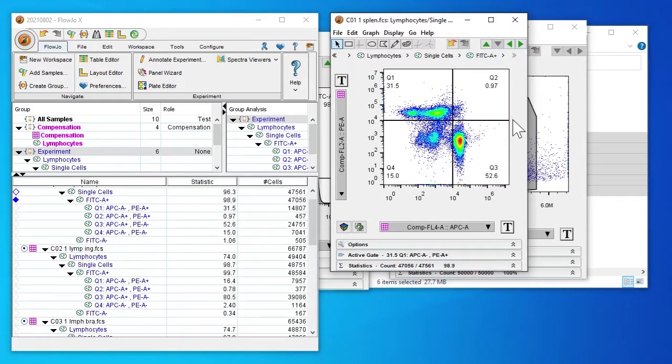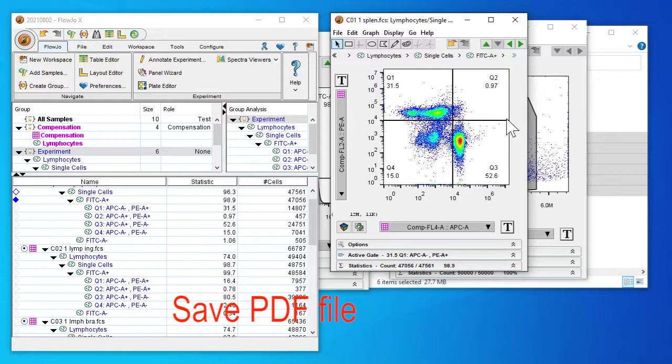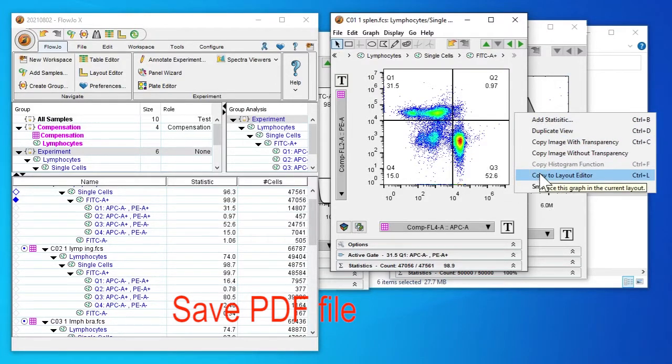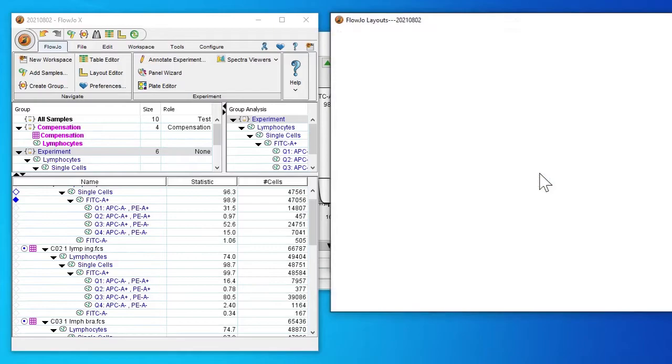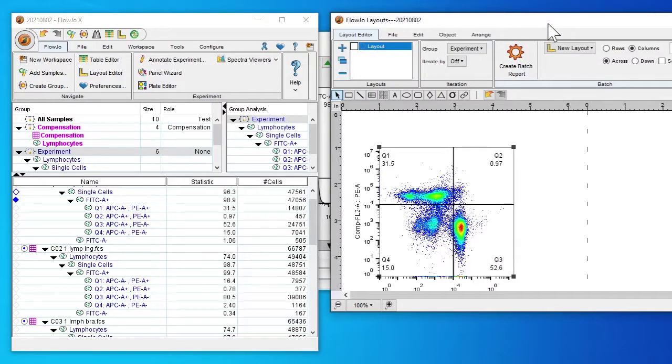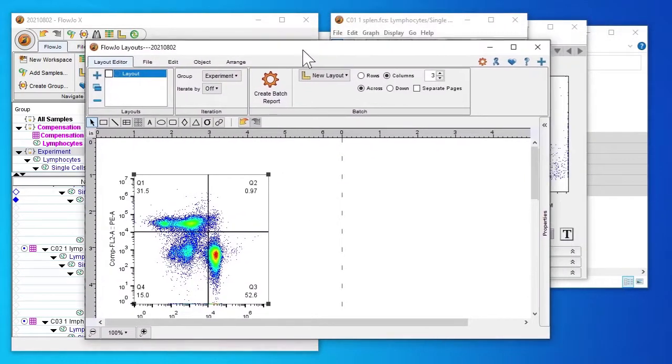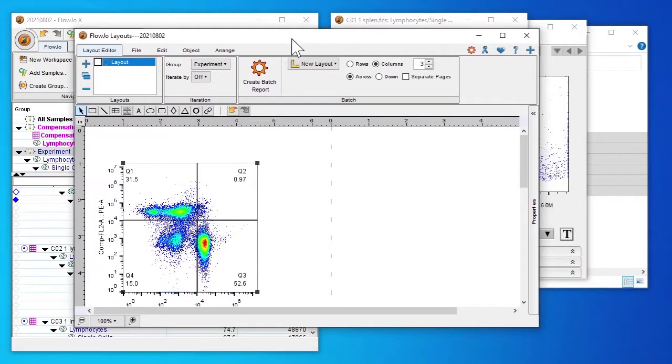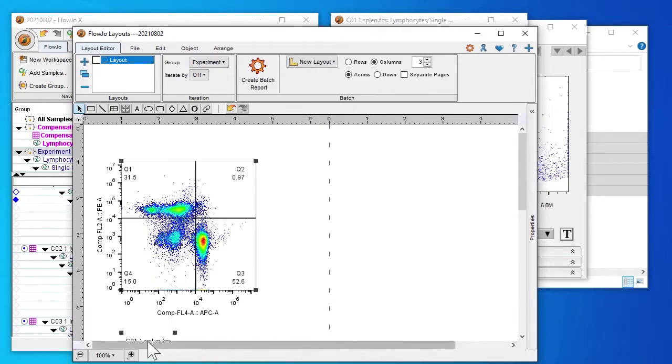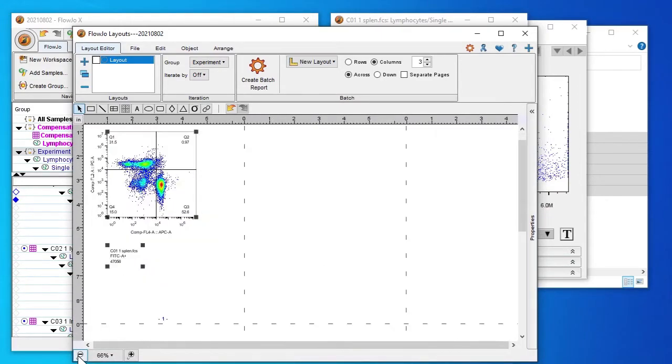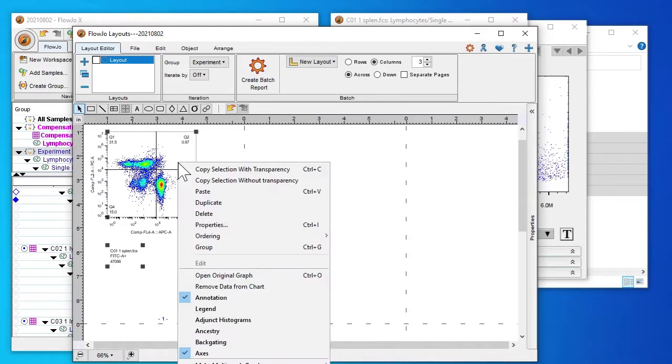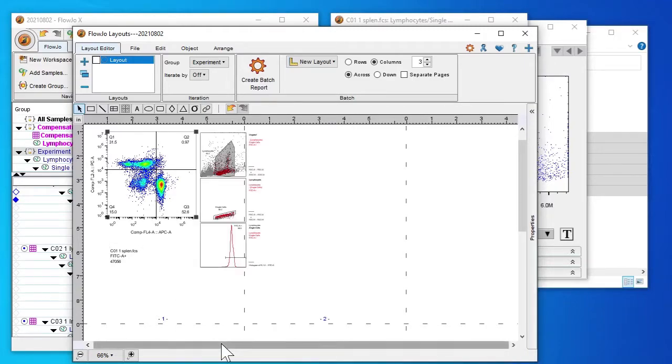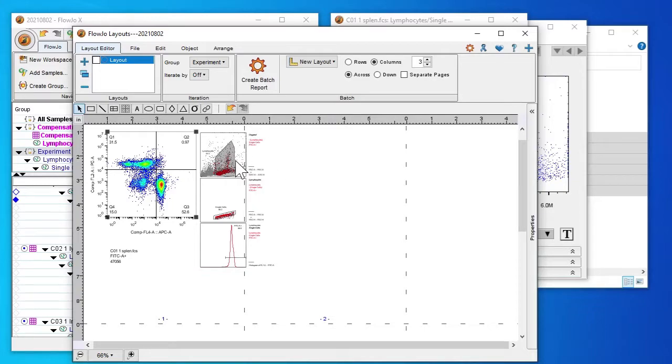Next I want to save a PDF file. Right click, click copy to layout editor. If I right click I'm able to click on backgating and this shows where our sample has come from. First we have a lymphocyte gate and single cell gate and then GFP positive cells.